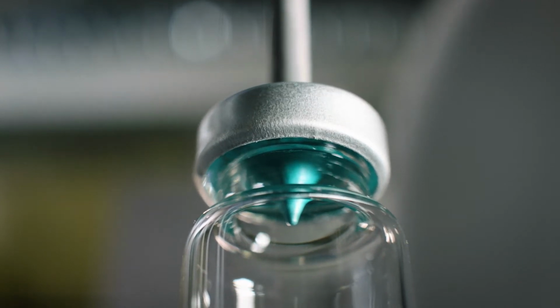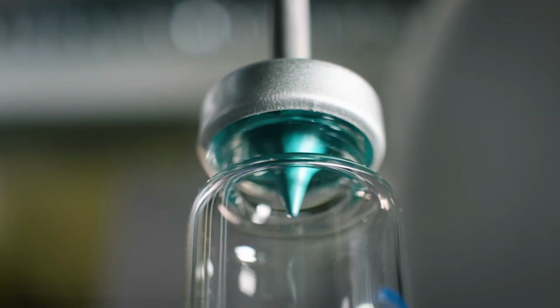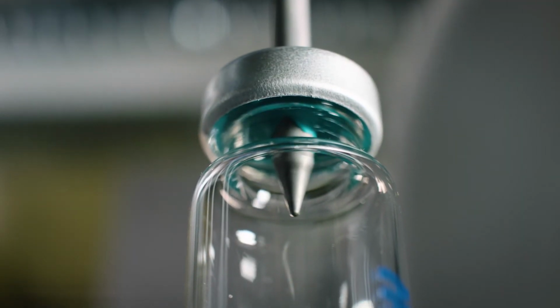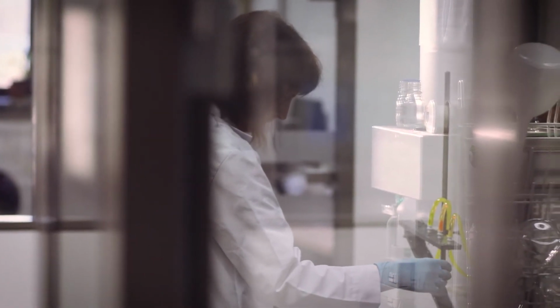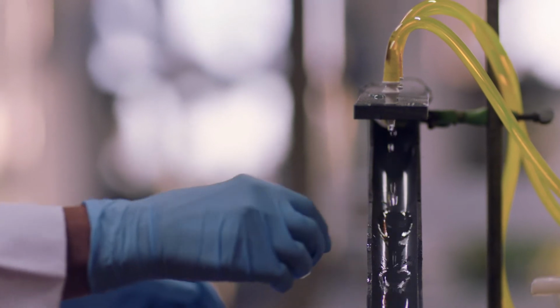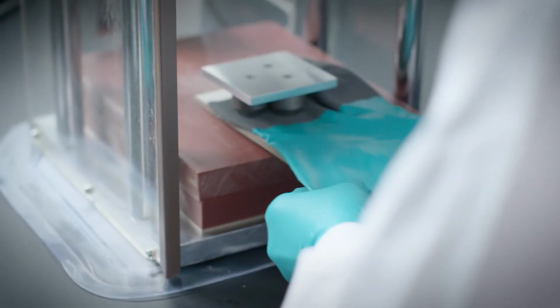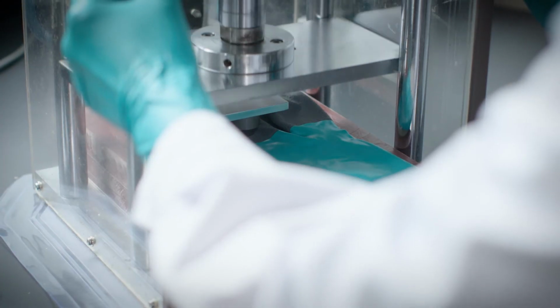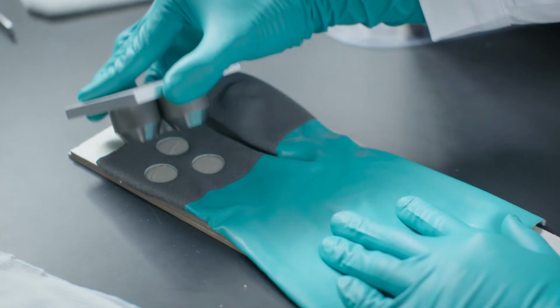Completely new for this standard is a degradation test. The glove will be perforated before and after contact with a specific chemical. So this is to simulate the chemical protection when you actually have mechanical influence on your glove. Another big difference is the sampling. We will test 3 samples from the palm, and if the glove is equal to or larger than 400 millimeters, we will also test samples from the cuff.